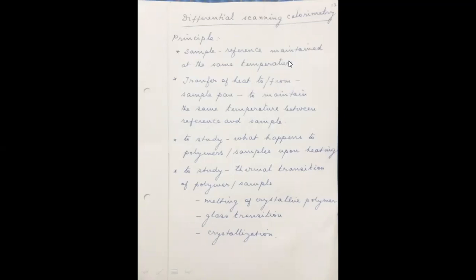And also, in crystallography, you might have studied a very important concept called glass transition. There is a temperature called glass transition temperature. It can also be followed using this differential scanning calorimetry.